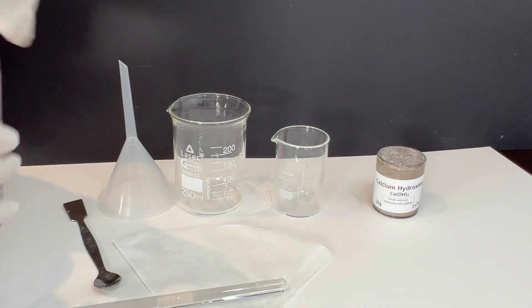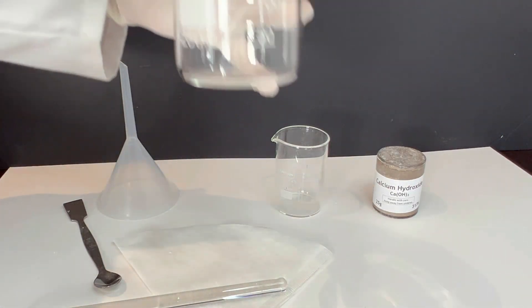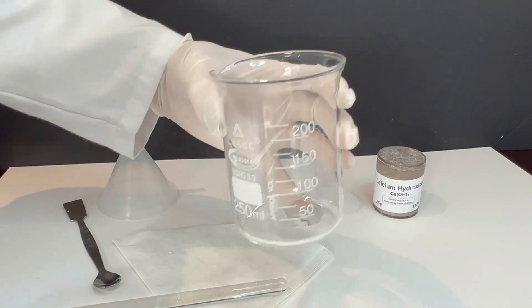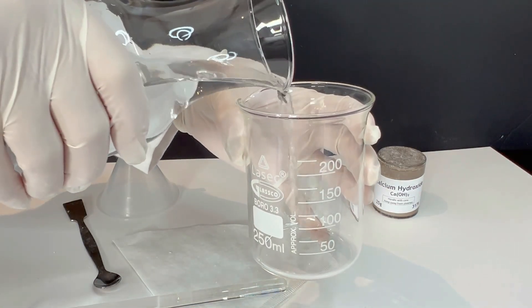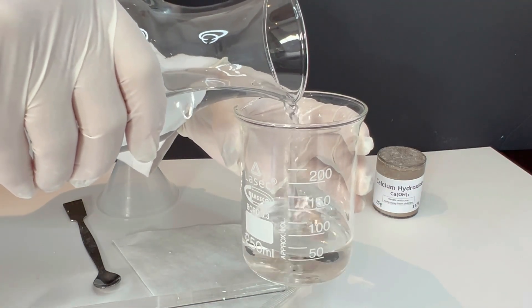Take a clean beaker and add about 100 milliliters of water. Then after that, add about one spatula of calcium hydroxide powder.